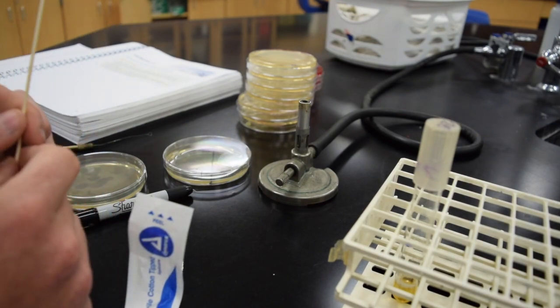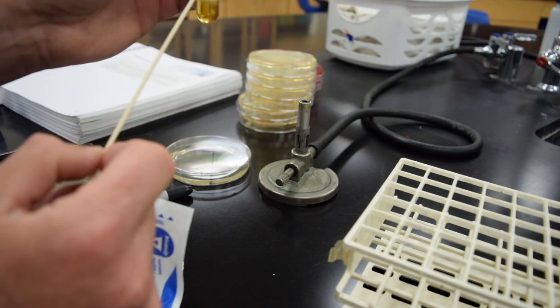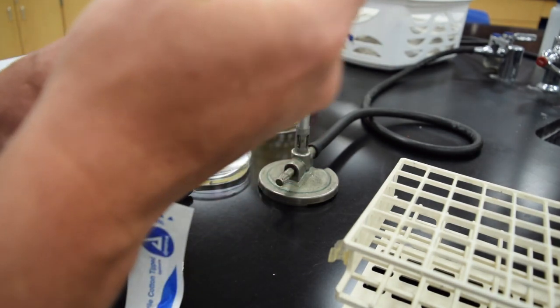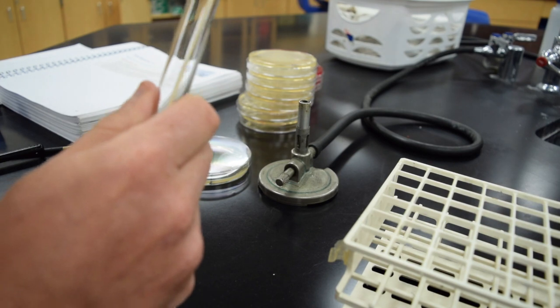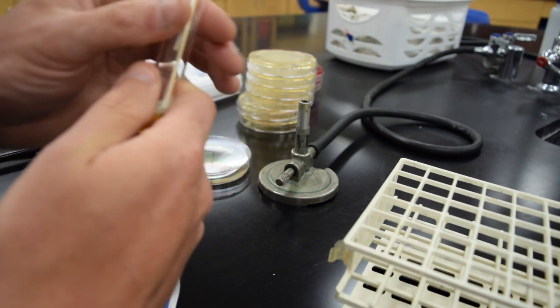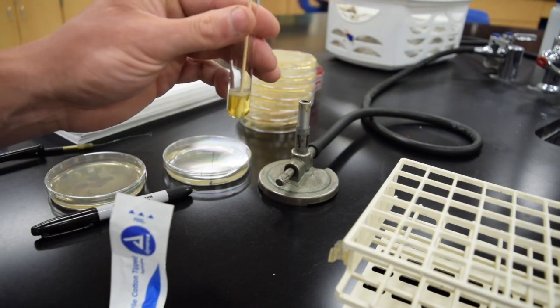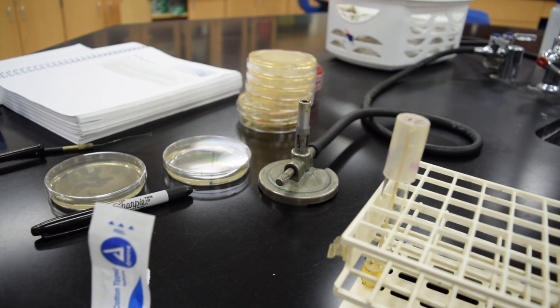Also in Lab 1.2, it says to inoculate a broth tube. You can use that same swab and simply put it back into the broth tube, break the top of that swab off, and put the cap back on. These will go in a special rack and we'll incubate those for 24 hours and see what the results look like. Alright, just a quick demonstration video for those first few labs.